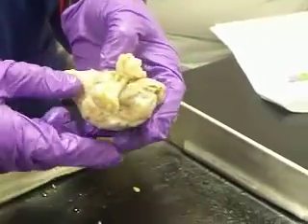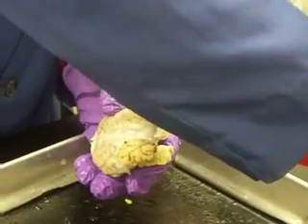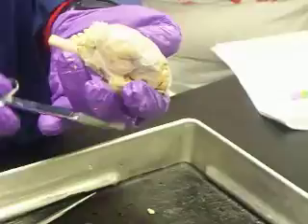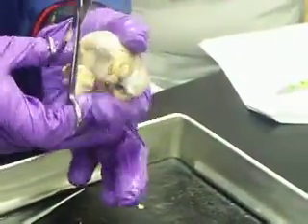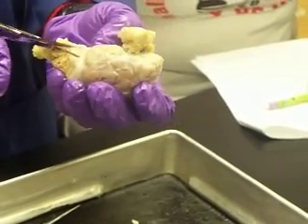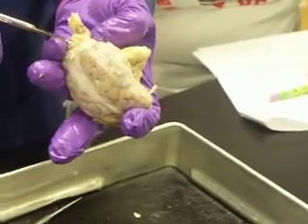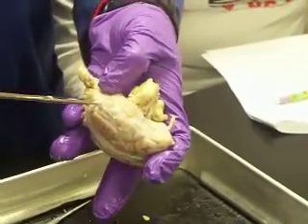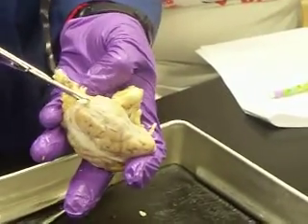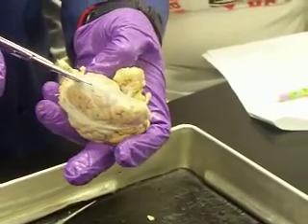Alright, so then what we need to do is I need to have a pair of scissors and just begin to cut a little bit. And I guess I would probably start superior or laterally. You have to just kind of cut in. It's more durable than you think it would be. Just cut through the arachnoid there.